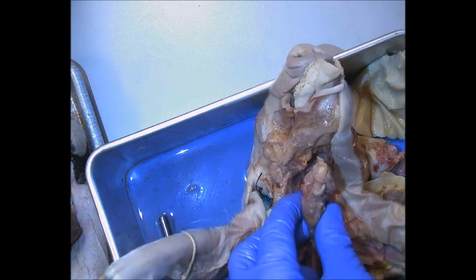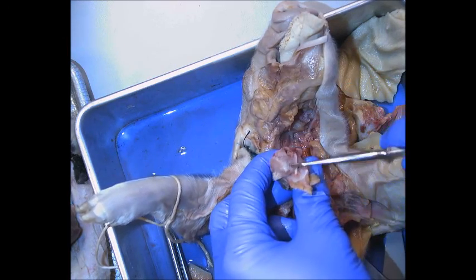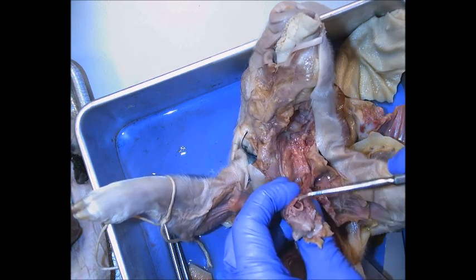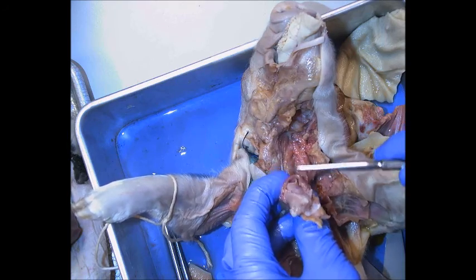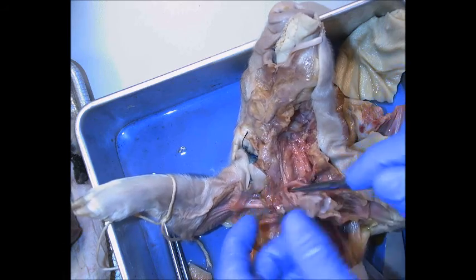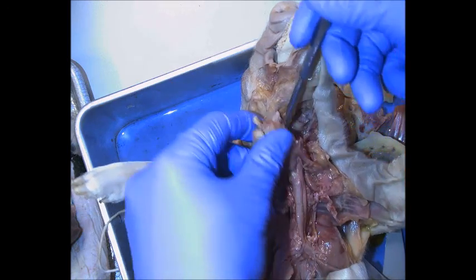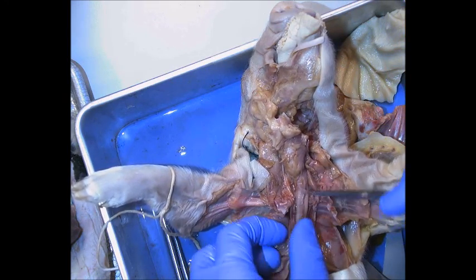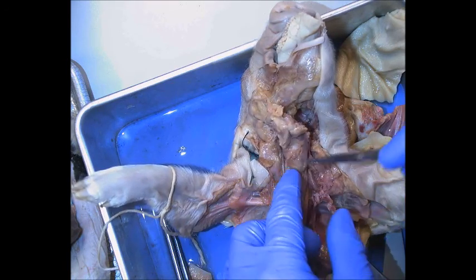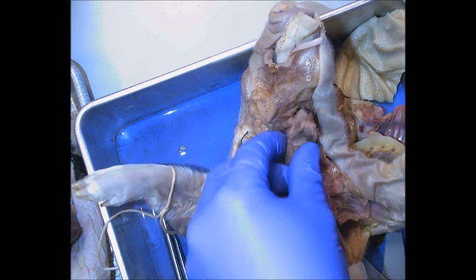Here is the larynx — this is the thyroid cartilage. Up top, what will become the hyoid bone is still a little bit cartilage. Pull this back and you'll see this flap is the epiglottis covering the hole, the glottis. In the back you'll see the esophagus, which is posterior to the trachea. This whole tube with rings of cartilage is the trachea, with the esophagus directly posterior to it. The thyroid cartilage is made of hyaline cartilage; the epiglottis is made of elastic cartilage.